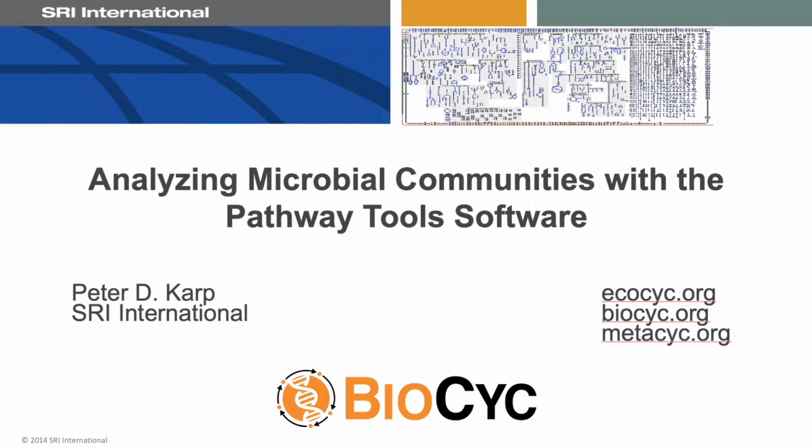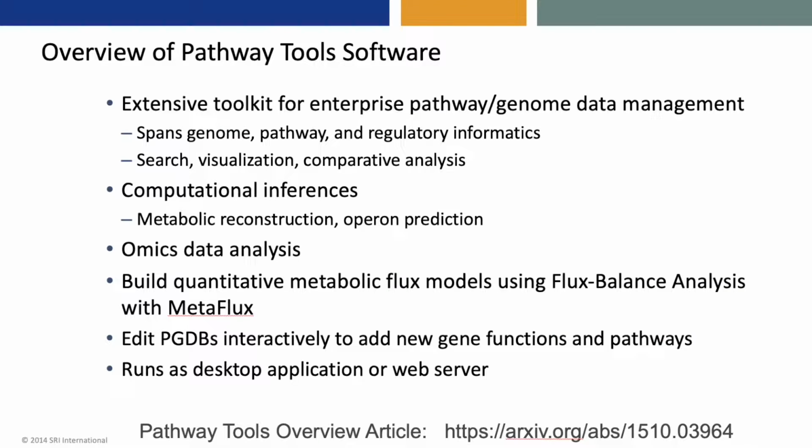This talk will discuss the analysis of microbial communities with the Pathway Tools software. Here's an overview of the Pathway Tools software. It is an extensive toolkit for enterprise pathway genome data management. It includes genome, pathway, and regulatory informatics, and its capabilities include search, visualization, and comparative analysis.